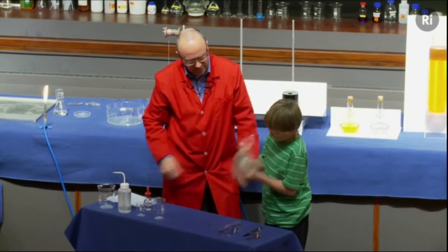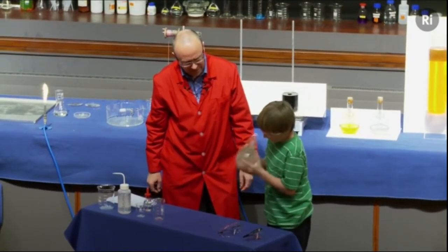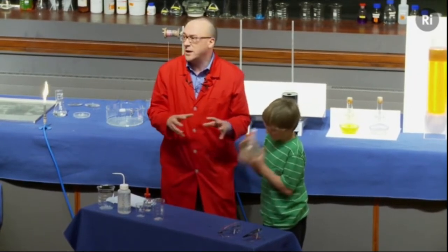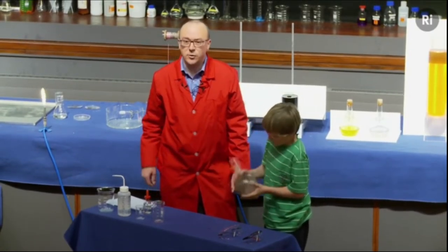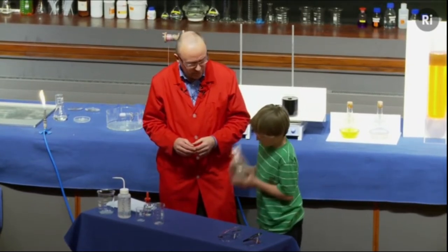That's it. Really hard shake. That's good. Keep shaking. So what's happening inside this flask now is there is a chemical reaction taking place, and it's forming a solid. And the actual material that it's forming is silver. We're making pure silver metal. Keep shaking.